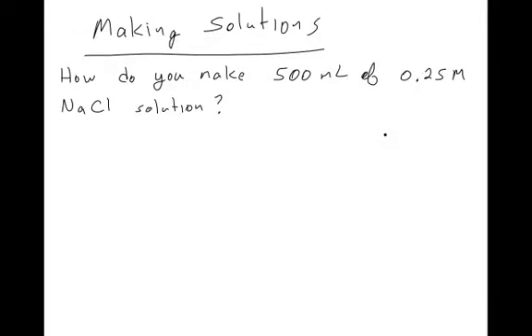Okay guys, today I'm going to show you how to make solutions, and we'll be doing a lab on this in the near future. You've learned about the molarity equation: molarity equals moles per liter. So how do we actually apply that and make some chemicals in the real world, in a laboratory environment? Here's your question.